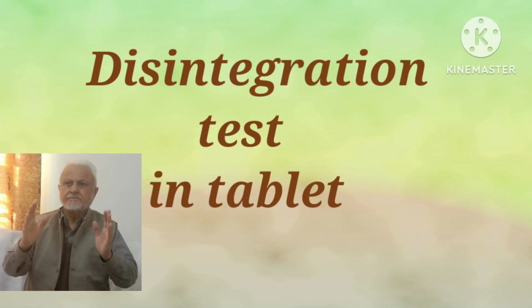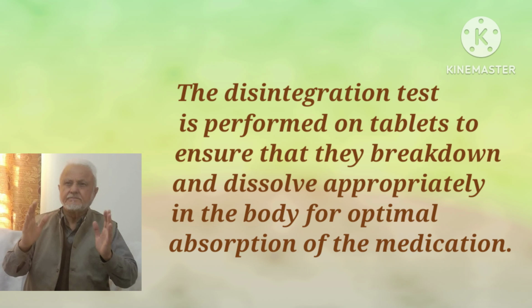Disintegration test in tablet. Disintegration test must meet the specifications, otherwise you will not be able to run the machine. The disintegration test is performed on tablets to ensure that they break down and dissolve appropriately in the body for the optimal absorption of the medication.